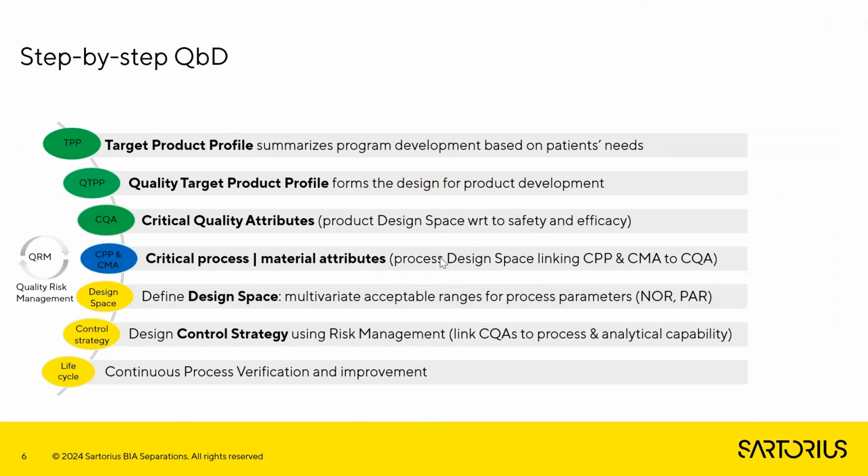to more concrete. Once we understand what are the critical quality attributes, we then need to control them, we need to derive them through controlling our manufacturing process. And so those two are critically related. And again, we'll be building some understanding between critical quality attributes and the process for making mRNA.